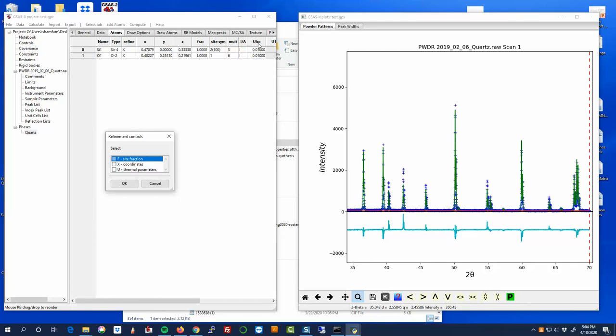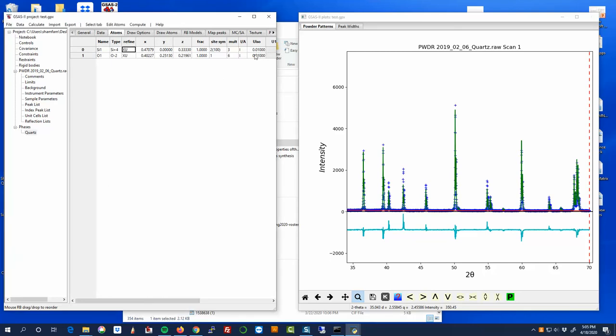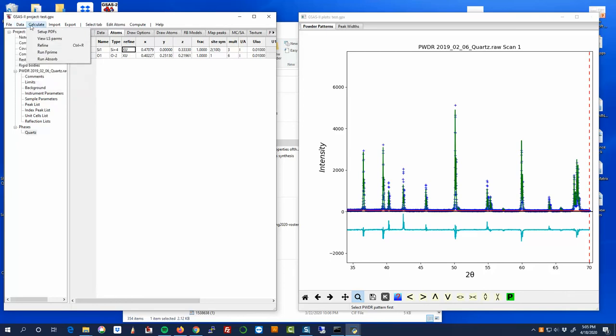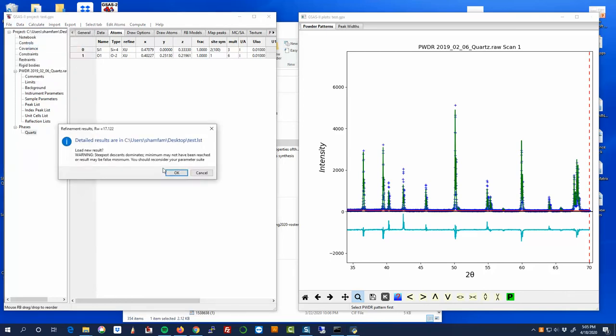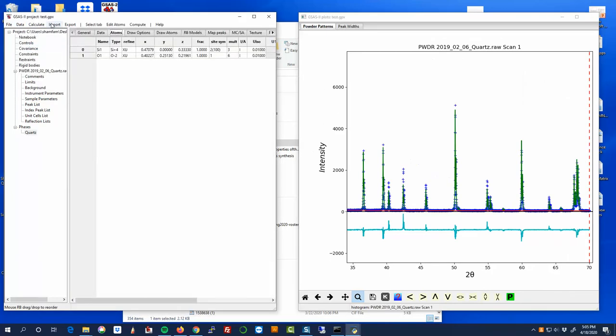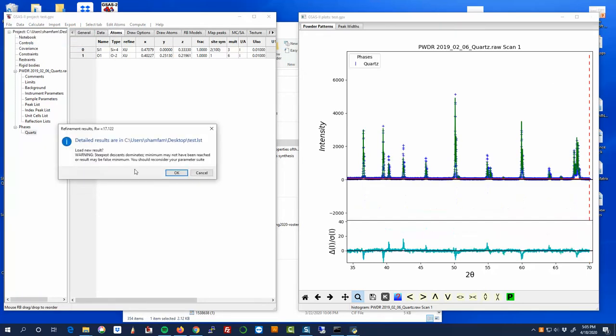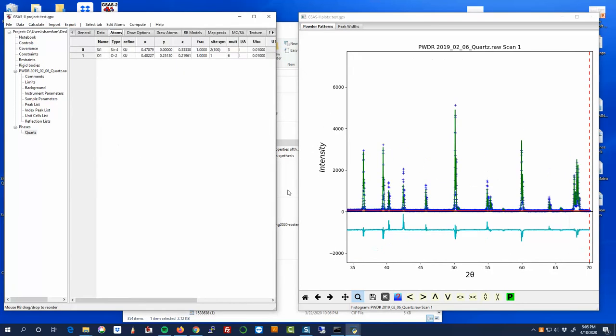And we can try one additional thing. And we hadn't done this before. But we can actually try refining this uiso term. Uiso, or sometimes it's called biso, this is a parameter that describes thermal vibration. So basically, it's trying to treat atoms as points in space. And so there's some known electron density associated with that point. The larger the uiso is, the more diffuse and spread out that point is. So this is another thing where you want to be a little bit cautious and make sure you're keeping an eye on what these uiso values are. I've seen automated refinement programs that you click a button and it tries to do the refinement for you and it can have an incredibly close match. But then you come back and you look and you get non-physical, non-realistic values. So if this starts to get very large, then you should start to question it because it's probably not really reflecting a physical reality. So I will come down here, calculate, run the refinement again. And let's just run it one more time. So we're kind of sitting here at this 17.5%. So this is, honestly, that's not so great. We should be able to do better.